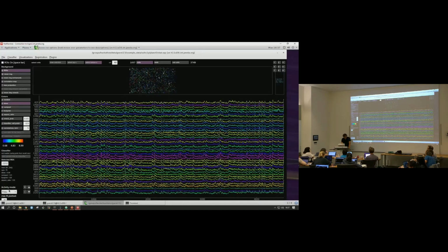When you're in this view, can you see the neuropil trace so that you could kind of look? Not together at the same time, but we could switch to it. So if I switch the neuropil trace, right, that's a lot more homogeneous between cells.